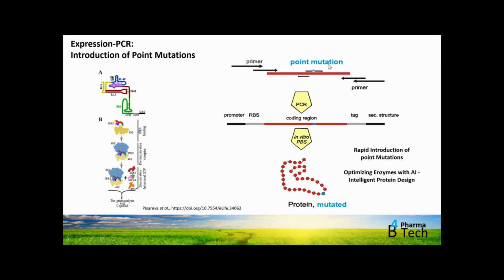And if you want, you can also add some internal PCR primers, thereby introducing point mutations, for example, stop codons like the amber stop codon for site-specific labeling of a protein. So this simple procedure is then a 2 or 3-step PCR for the introduction of the amber stop codon at a defined position for the modification of your protein of interest at a very defined position.